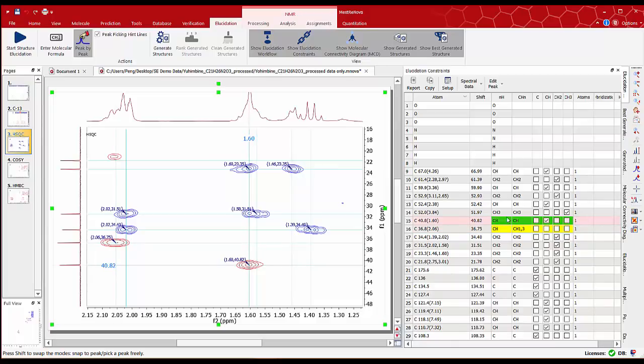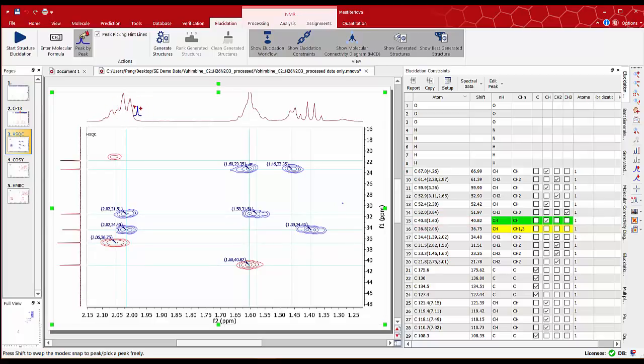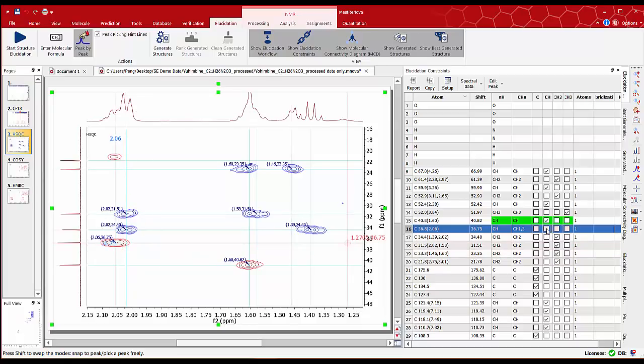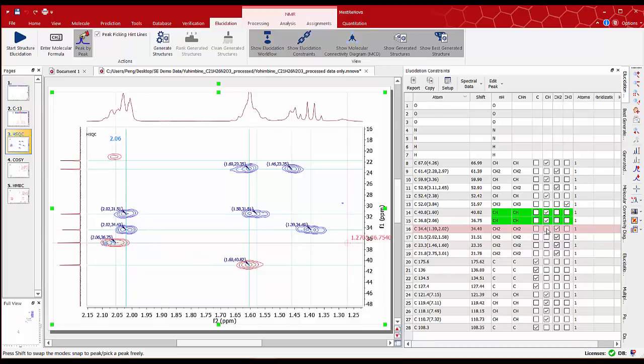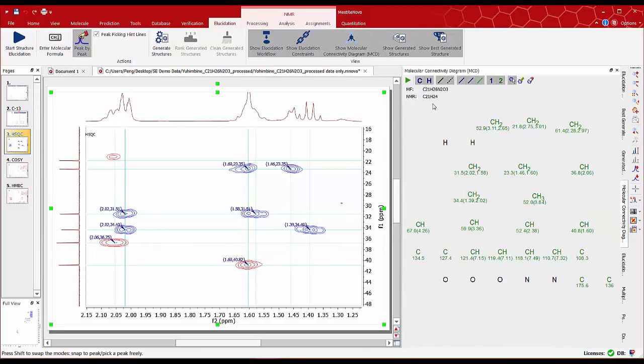We can do the same for row 16 with chemical shift around 2.05 ppm. From the integral value we can see it can only be a CH group. So we can edit it in the same way as we did for row 15. Back to the MCD diagram. We can see there are no ambiguities or messages in terms of proton assignments from the HSQC information.